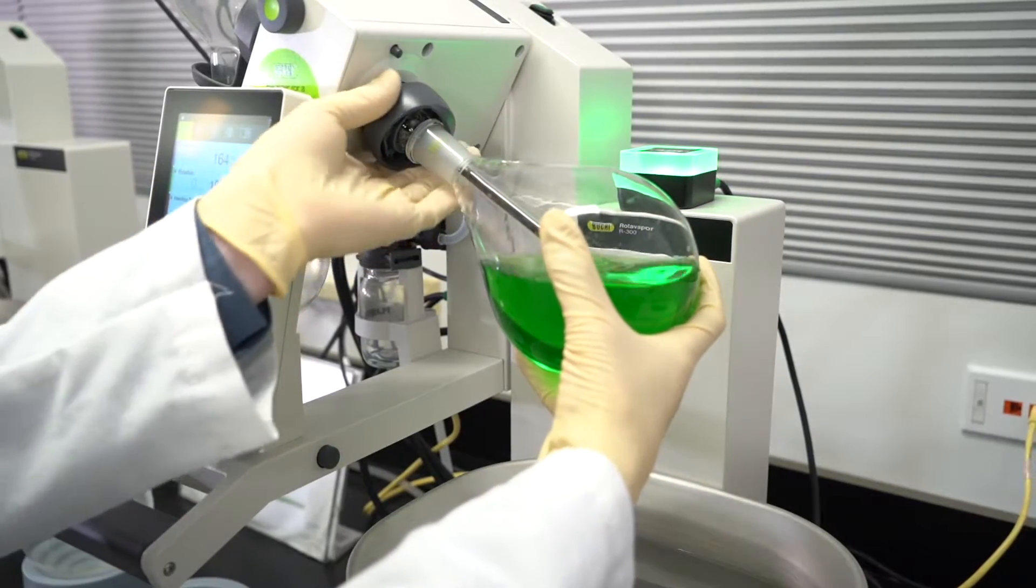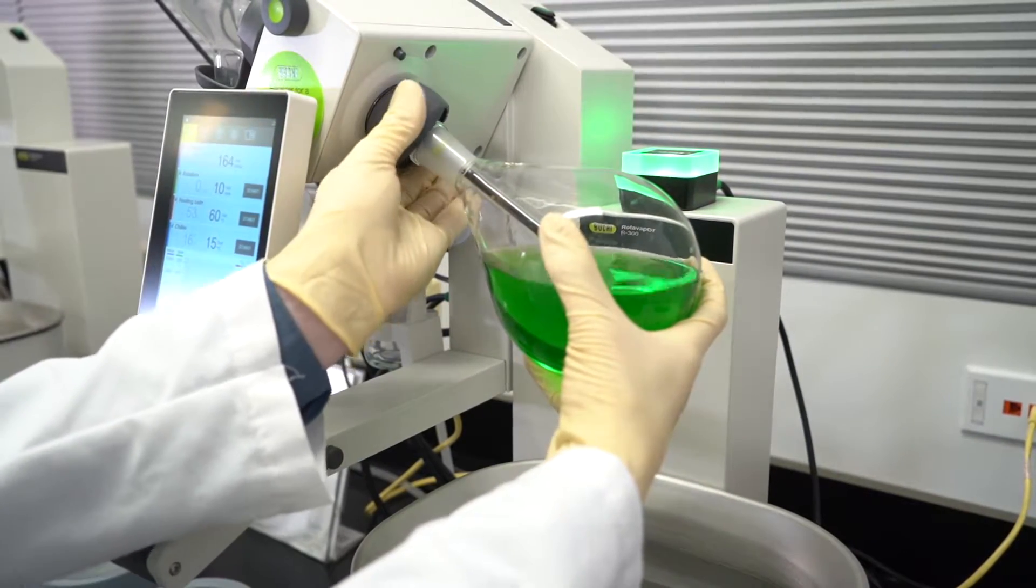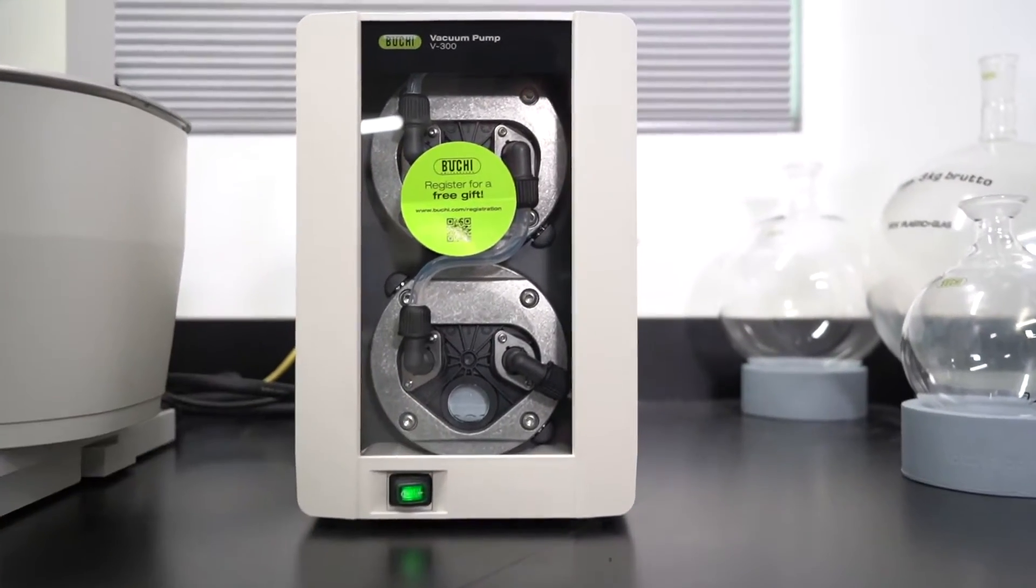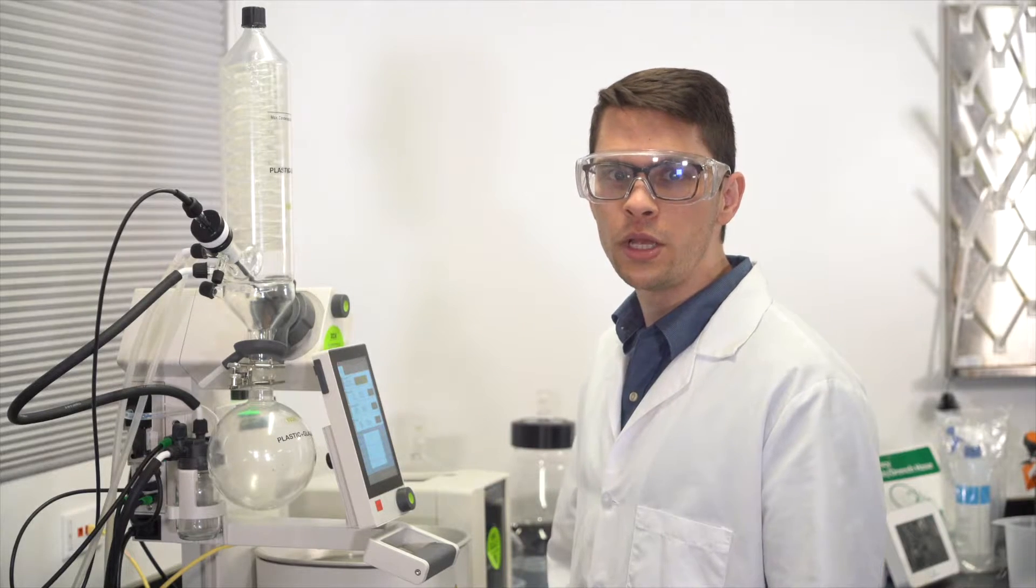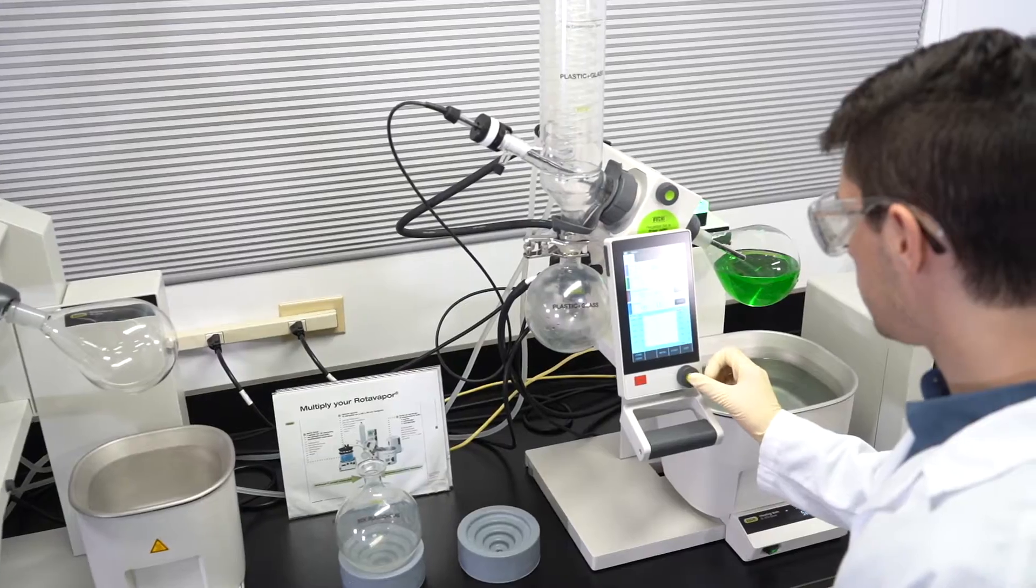The basic features and functional principles of a rotary evaporator are the same. A sample is placed in an evaporating flask. The vacuum pump lowers the pressure of the system. The advantage to vacuum distillation is that it allows for gentler and more efficient solvent removal since the boiling point is related to pressure. Reducing the pressure lowers the boiling point.